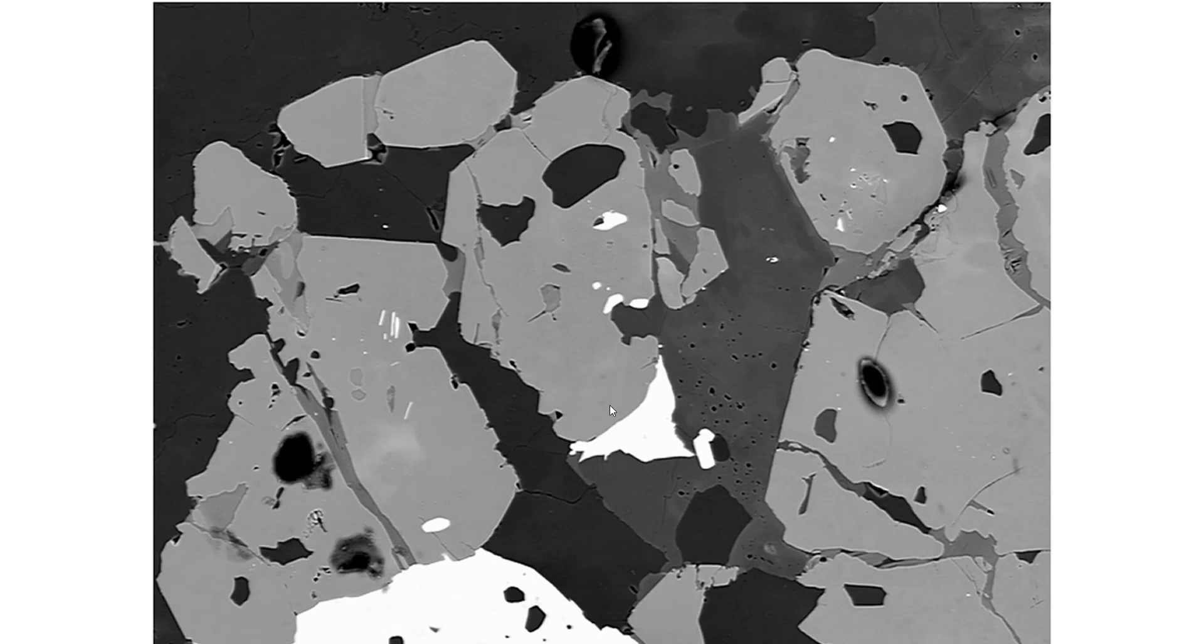Another good example would be if you already have a fluorescent image showing all the nuclei in blue, because you stained it with DAPI or something, then what's the point of using machine learning? So, I cannot stress this fact enough. Nowadays, people think about deep learning and try to use that to do a simple task. If you don't need to use deep learning, don't. Just use traditional means.